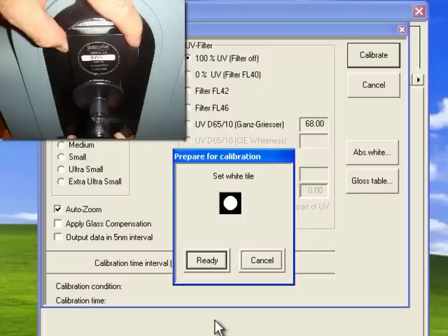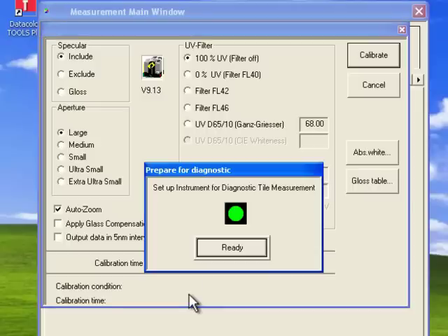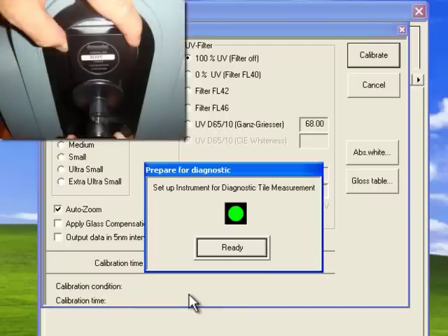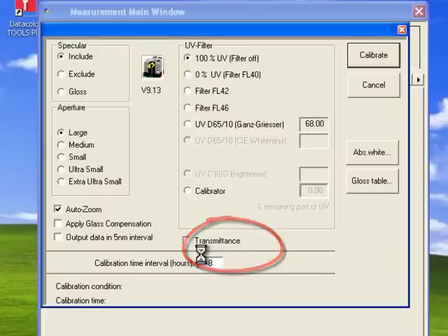When prompted, place the white calibration standard against the instrument and press Ready. Do the same with the diagnostic or green tile.